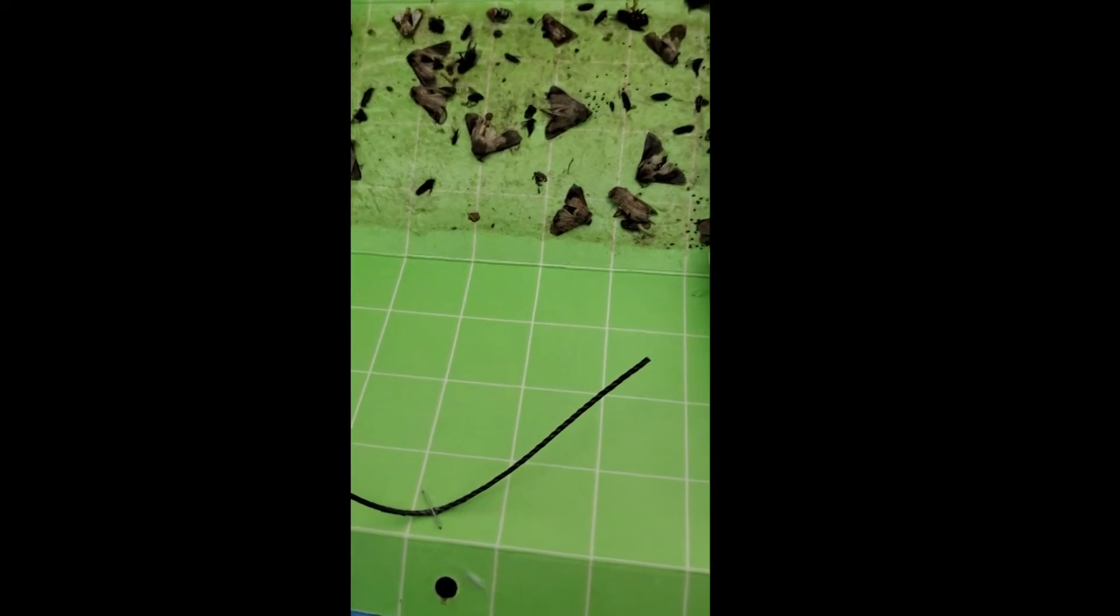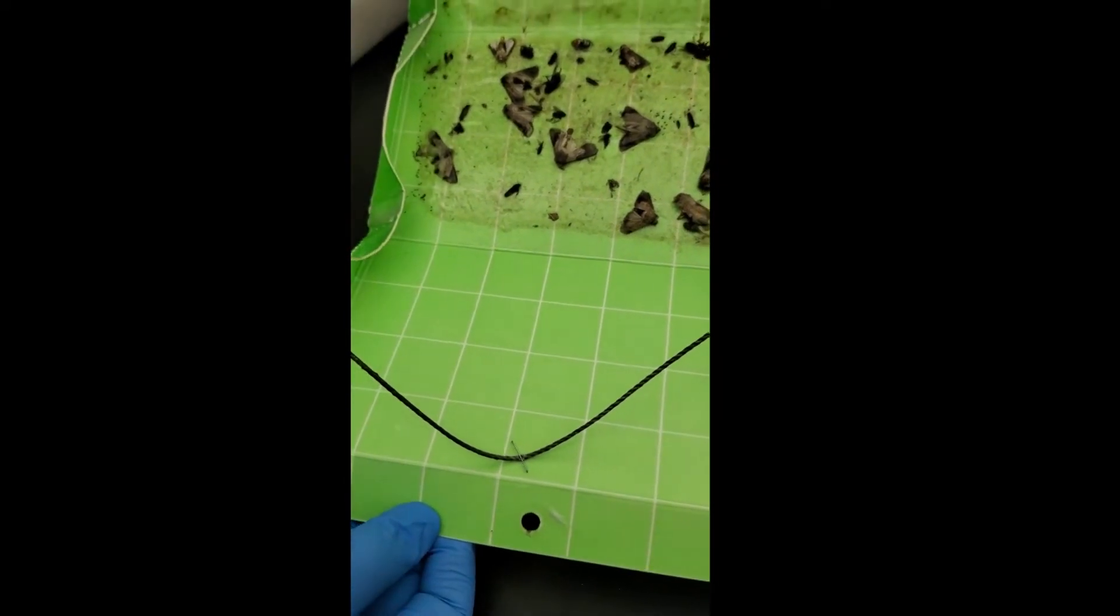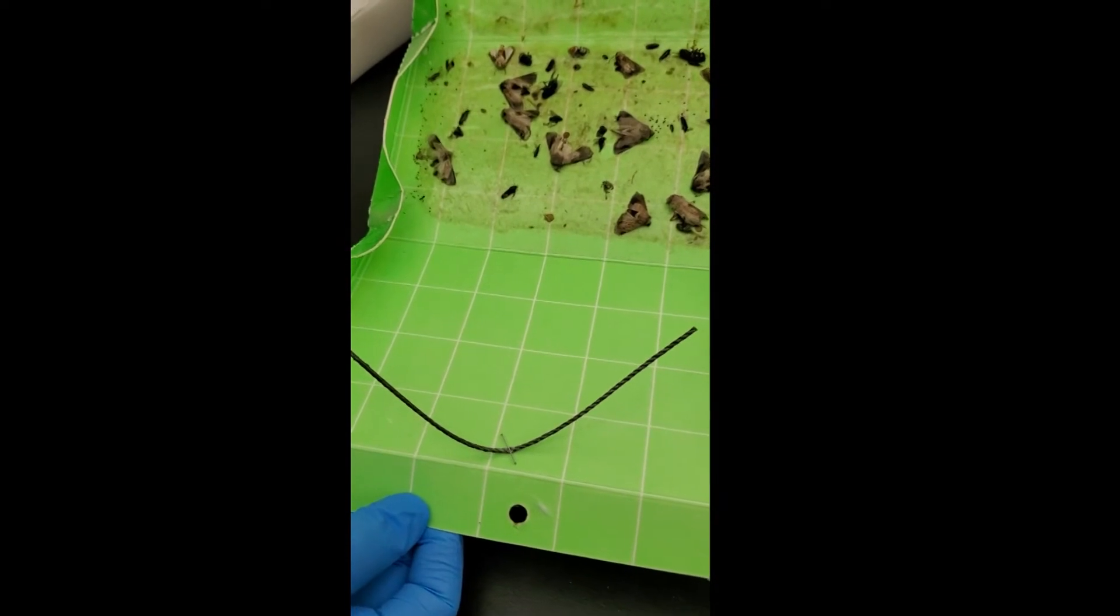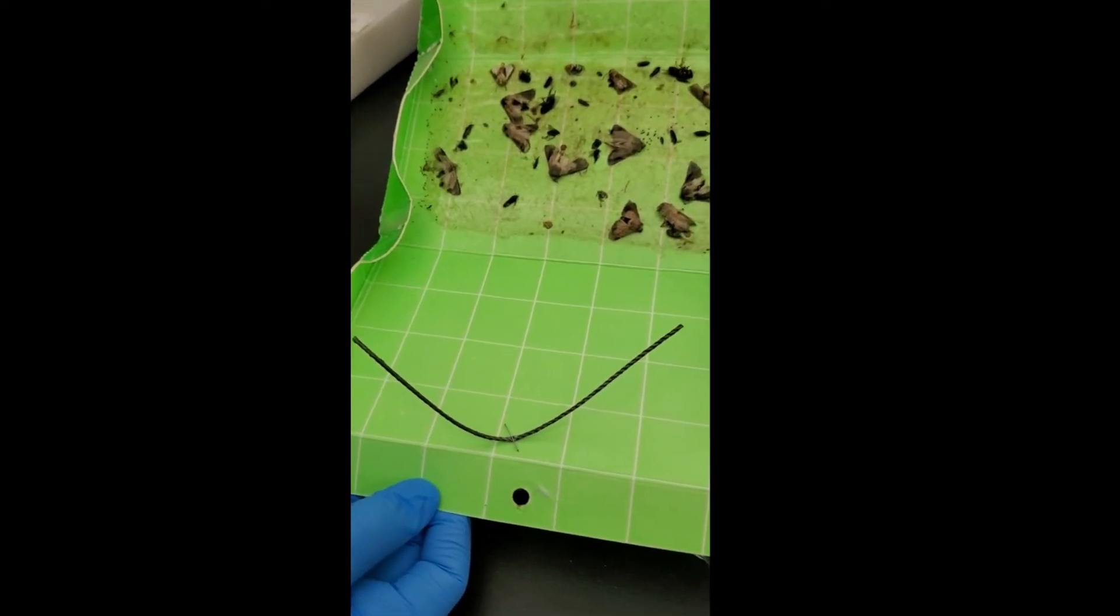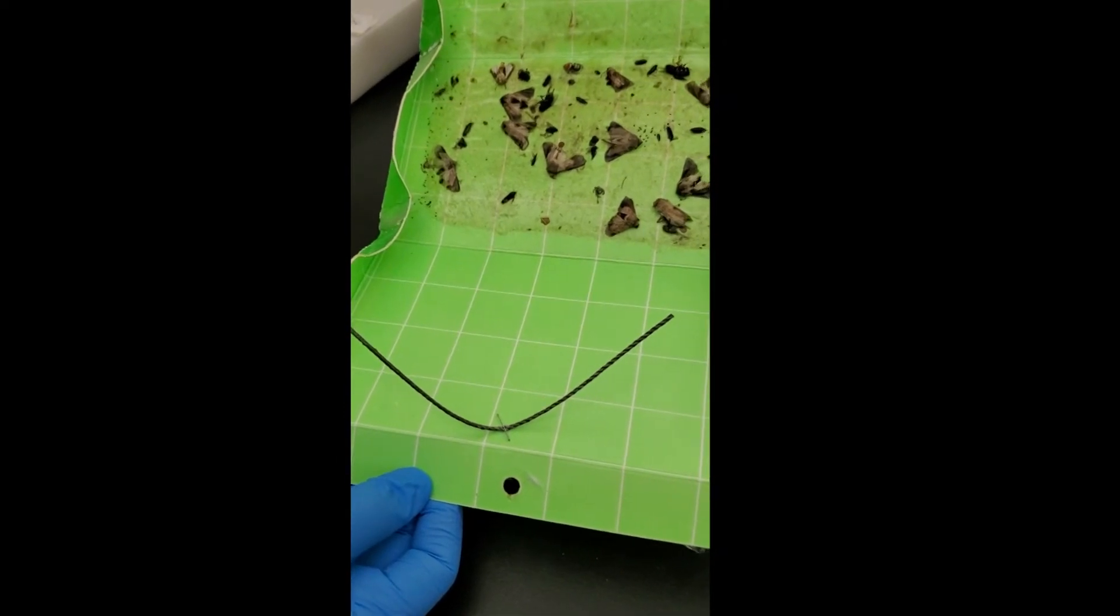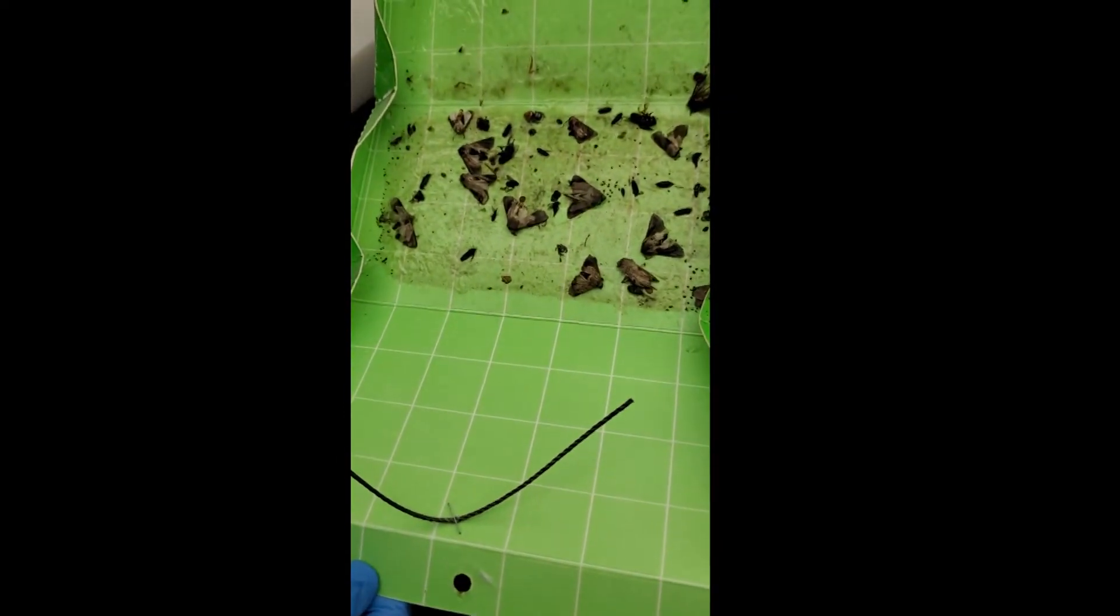Each trap that we use has a chemical in it or what we call a pheromone. And this piece of string has a pheromone for the gypsy moth. And the male moths can smell this up to a quarter mile away. And they're attracted to the trap and then get stuck in the sticky material. And then we can come in and if we find any, then we try and find out where they came from. And if we catch too many, then we go into an eradication program.